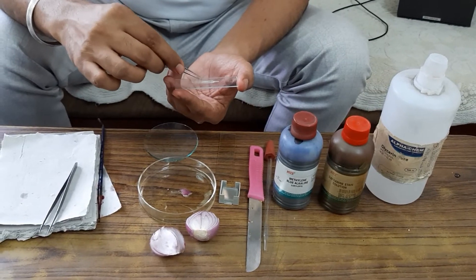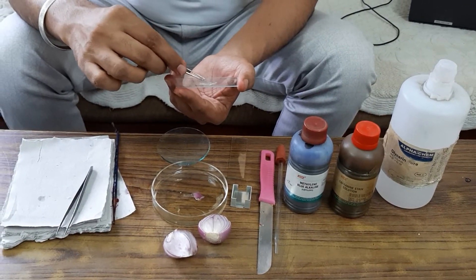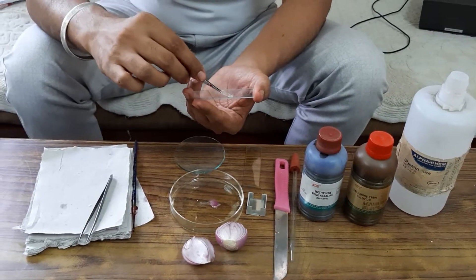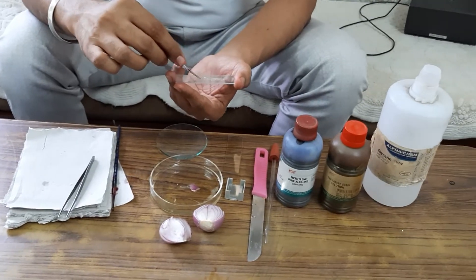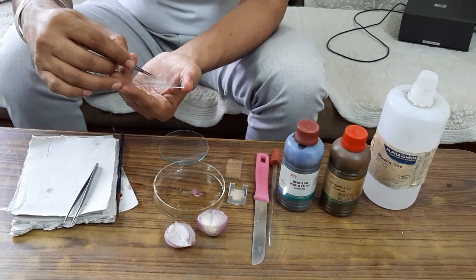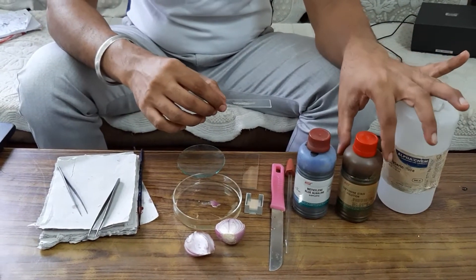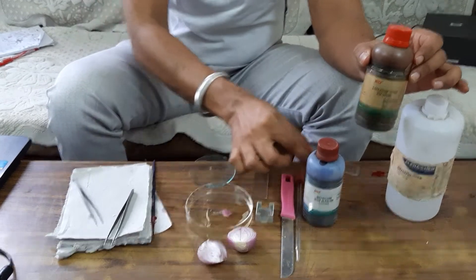Make sure the onion peel should not fold, otherwise you won't be able to observe the cells under the microscope. You can take a small piece of onion peel and cut it using a blade. My next step is to stain this onion peel using safranin.